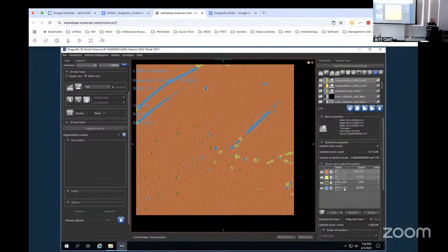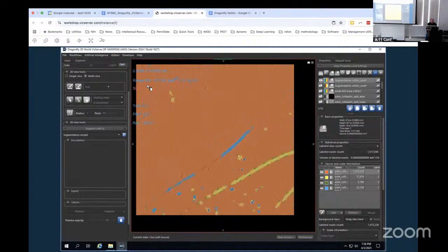There's no reason really to do what I'm doing. You could just push it all into the background by selecting background, holding control and clicking stuff. Now, I'm going to get this a little bigger. I'm going to try not to erase, probably already erased some filament. See, you have to be careful. Otherwise you have your 3D brush and it just erases something from down below.